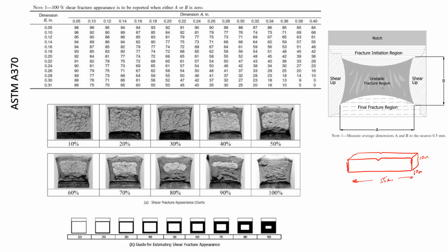The sample has the V notch at the center, right? So we place it under the machine and we allow the force to hit over here, and in turn, this breaks, right? After breaking, this is the type of face. You can see we'll take one part of the breakage, then we can see that it can be of any kind of nature here. Now we understand that this fracture happens through two modes. One is shear and another is called brittle.